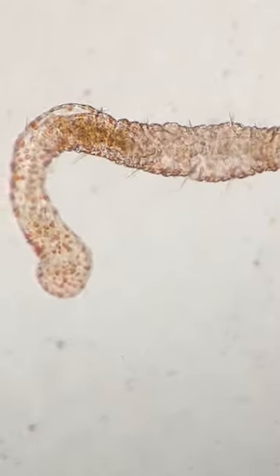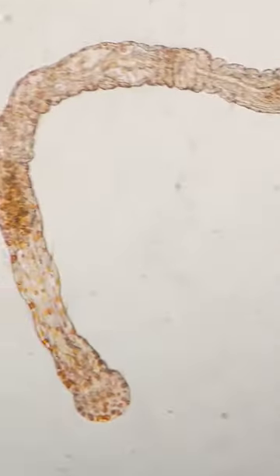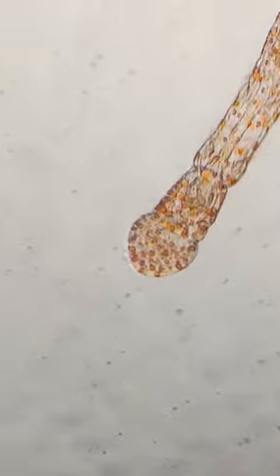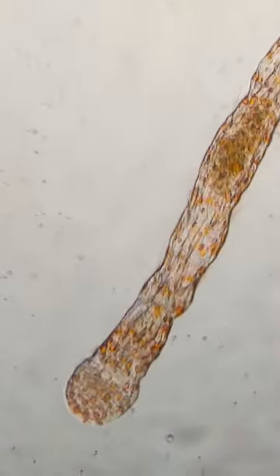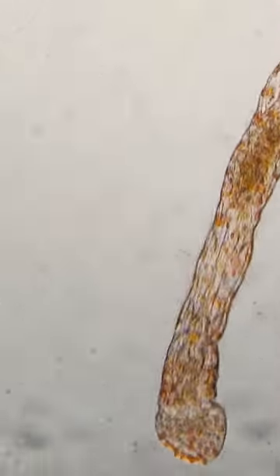This is an Aeolosoma worm. It's identifiable by its orange spots and unique shaved head. Similar to other microscopic nematodes, it reproduces asexually via budding of its tail end.